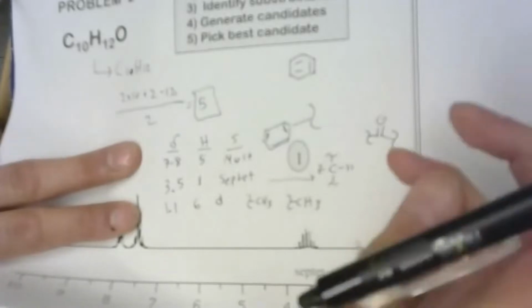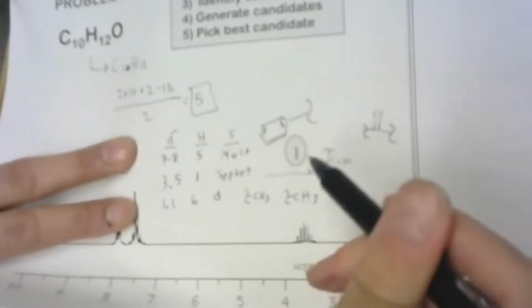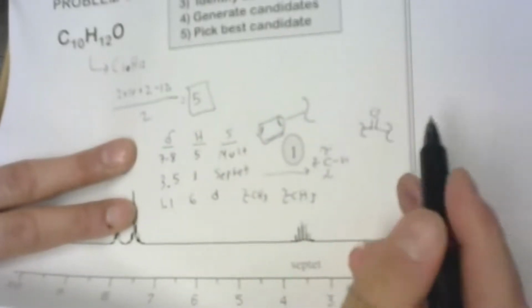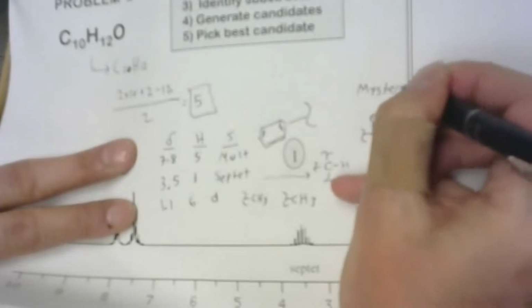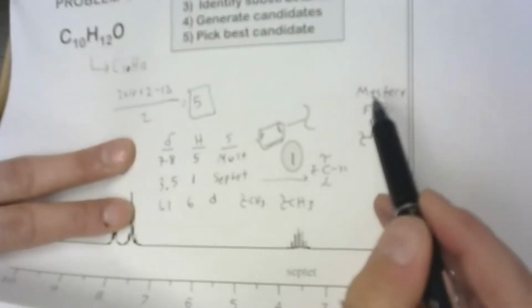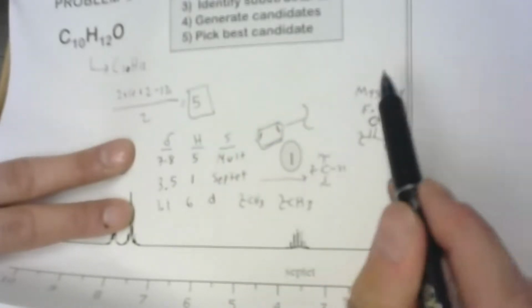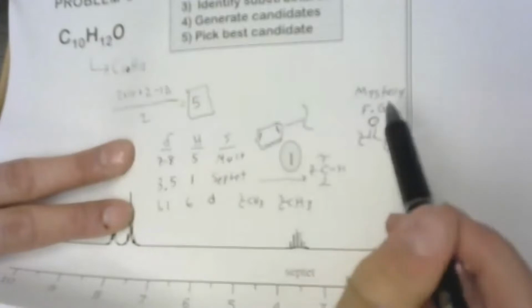Okay, so I got some pieces now. Erase this benzene up here. Okay, so how do I start connecting them? I look for some unambiguous information. I'm going to call this thing the ketone a mystery functional group. Because here and there we're going to have these mystery functional groups that we have to deduce. We figure out some substructures from our table, but then we'll have a mystery functional group that we have to figure out from our molecular formula, right? And the UN.